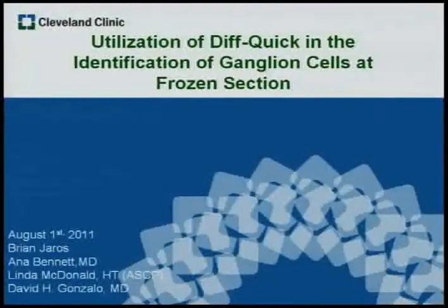During the summer, I participated in the Medical Laboratory Internship Program, working in the histology lab at the Cleveland Clinic main campus. The title of my research project is The Utilization of Diffquick in the Identification of Ganglion Cells at Frozen Section.